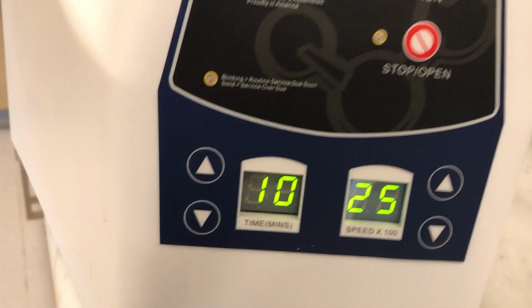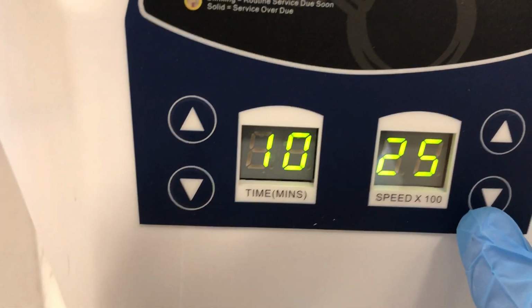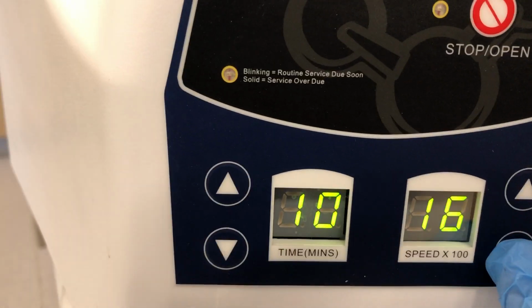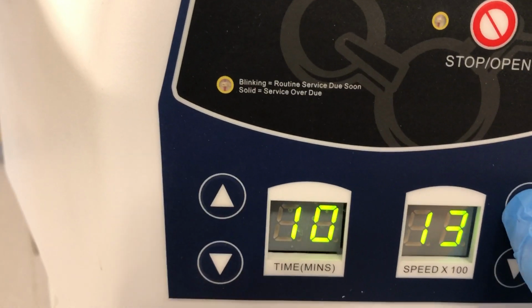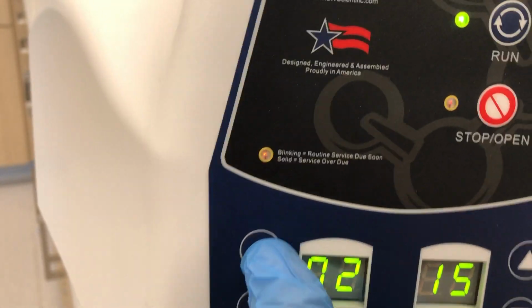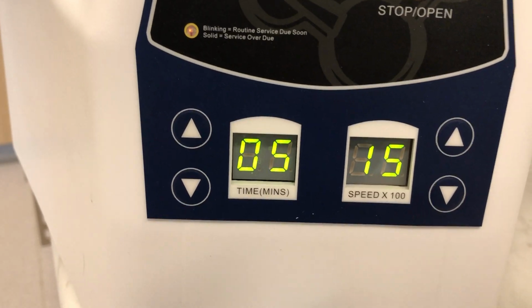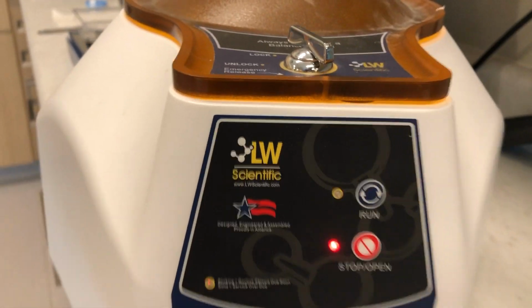Now we have to set our settings. So urine is spun at a slow speed, either 1,000 to 1,500 RPM. So right now it's set to 2,500. So I'm going to take the speed down. We don't want to spin urine too fast. Actually, I'll go to 15. And then for time, we only want to spin for about 5 minutes. Oops, I went too far there. So 5 minutes, 1,500 RPMs. Now I can go ahead and hit run.